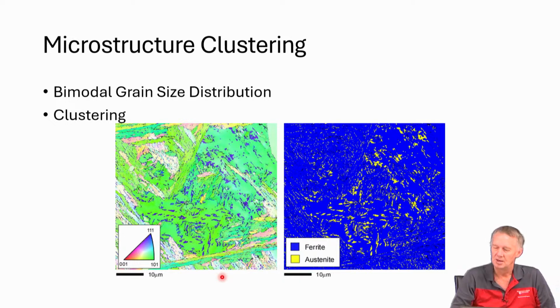Yeah, it should give reasonably good results, assuming the patterns are good and those bands are input correctly into the phases. Now you can put a lot more bands into the phases, right? You could put higher order bands, and then it becomes more convoluted.